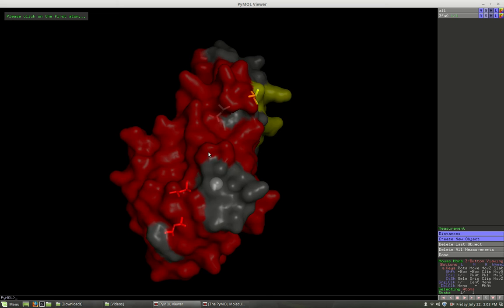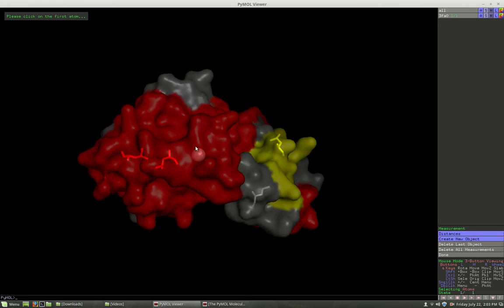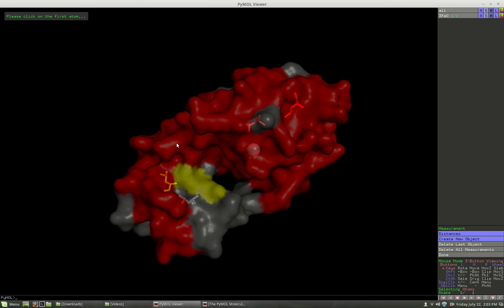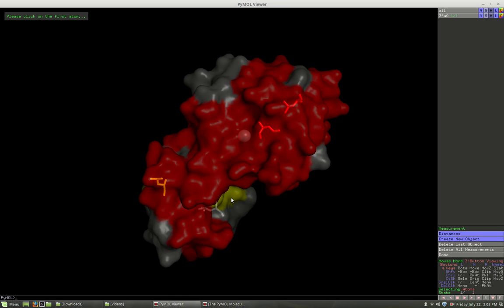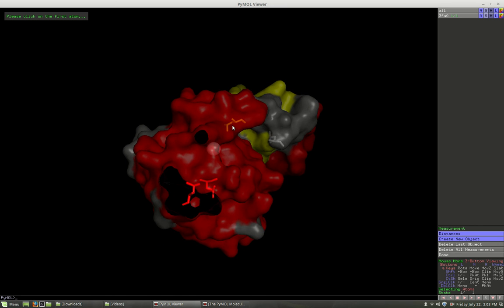Where is that particular residue? Might be slightly better, depending on what you're doing. Maybe you want to distinguish this from these side chains. Maybe see when it comes near those, you would rather see it as a sphere. An interesting thing to do.